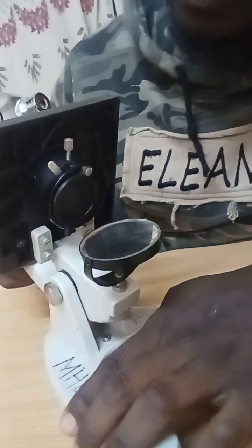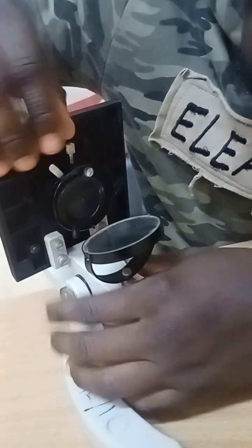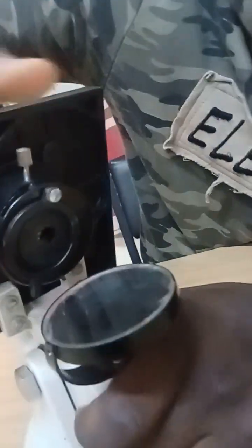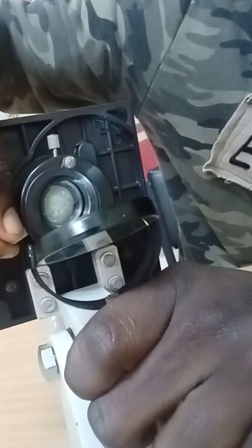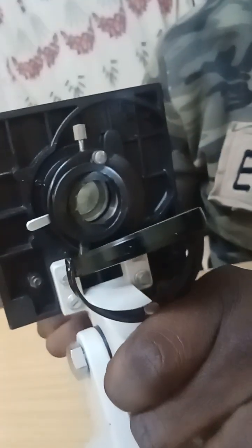And how does the light reach the stage? We have the diaphragm. You can see the diaphragm, it is just an aperture. As you can see, it is widening, then closing. The role is to regulate the amount of light passing through the condenser onto the object on the stage.